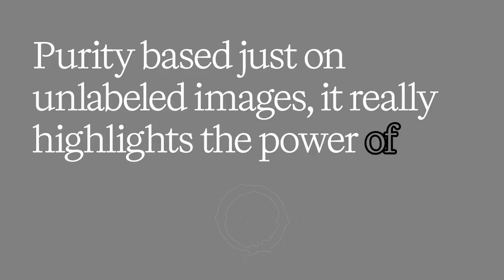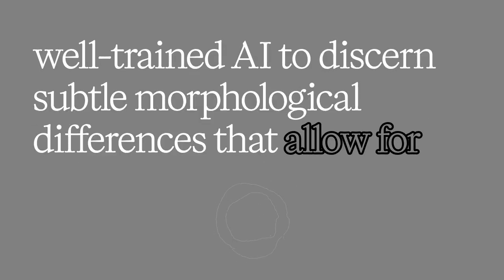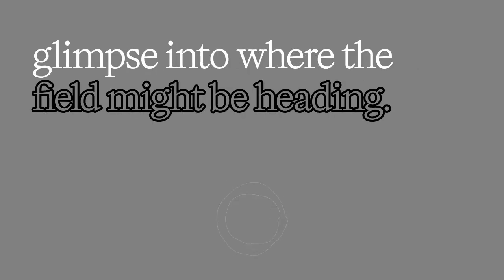It really highlights the power of well-trained AI to discern subtle morphological differences that allow for accurate sorting without any external labels. It's a glimpse into where the field might be heading.